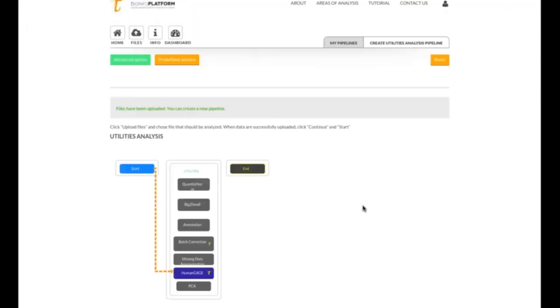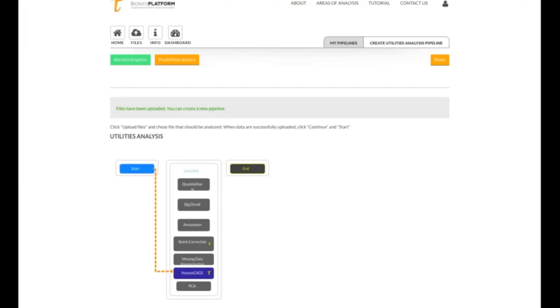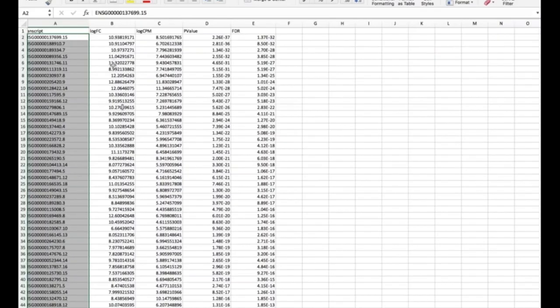And we'll see the output here in a second. Okay, so we see column name header is present, where the gene IDs are, and then where are the actual expression values, right? So let's take a look. Okay, so here we have EdgeR, yeah.